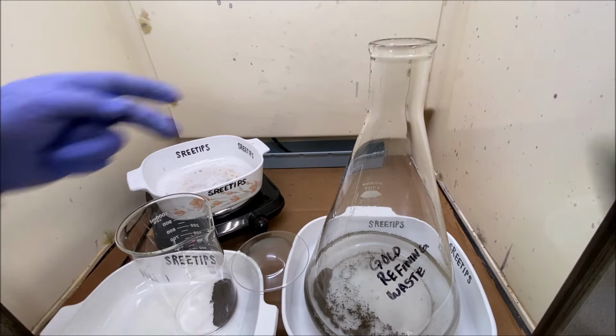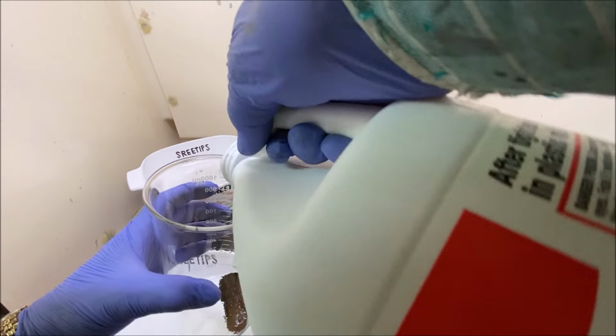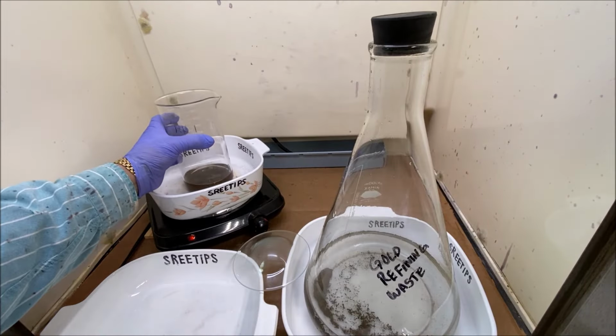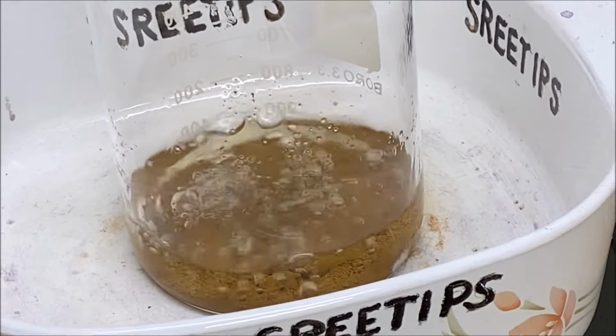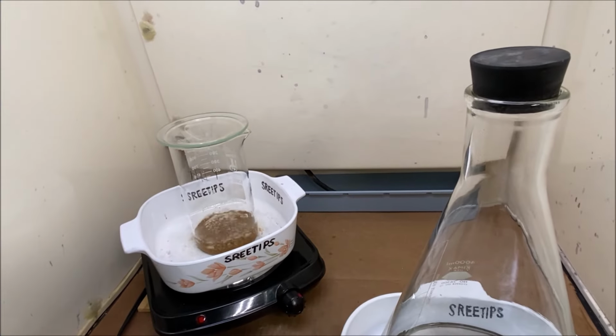Let's go ahead and put this up on some heat now. I'm going to add some hydrochloric acid to this. Put it up on the heat and let it boil in hydrochloric acid. That hydrochloric acid cleaned up the gold for us. Looks a nice caramel brown color now.